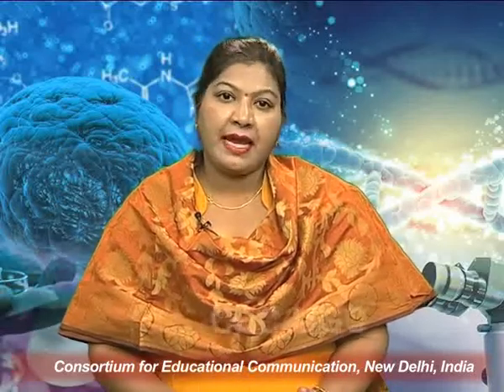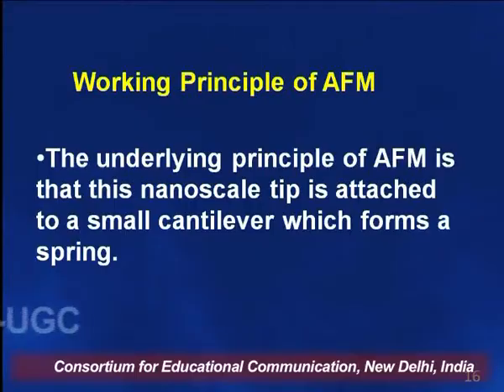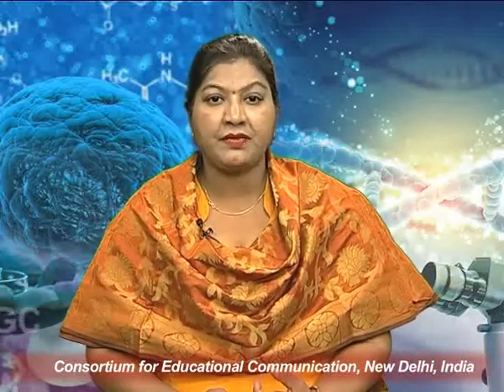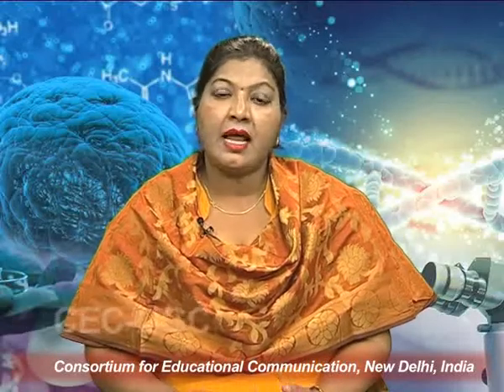Next, working of AFM. How does AFM work? The principle of AFM is that a nanoscale tip is attached to a small cantilever. Here we see that this tip is of the size of the nanoscale. That's why it can scan a single molecule. So we use the nanoscale tip attached with a small cantilever which forms a spring. Why do we talk about it working as a spring? Because it will vibrate at the surface of the specimen, or it will move through the surface.